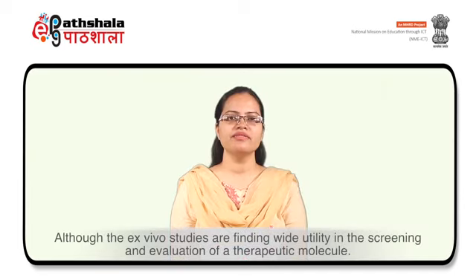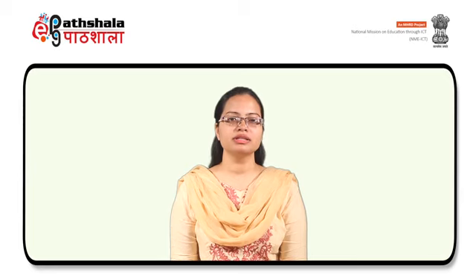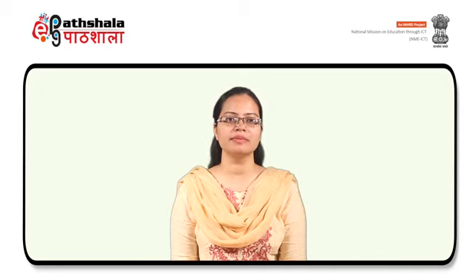Although the ex vivo studies are finding wide utility in the screening and evaluation of therapeutic molecules, they have several limitations which should be considered while extrapolating the results to in vivo studies. The animal species differ in the thickness of the nasal epithelial tissues, which is further complicated by the amount of connective tissue left on the serosal side of the epithelium after tissue preparation. The current lack of standardization of the experimental conditions with respect to the temperature, gas perfusion, tissue incubation medium and the stirring conditions further complicates the in vivo extrapolation.